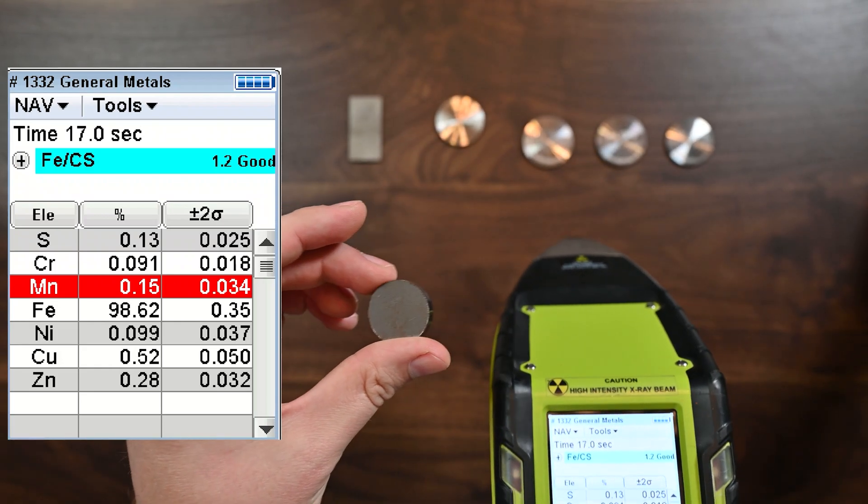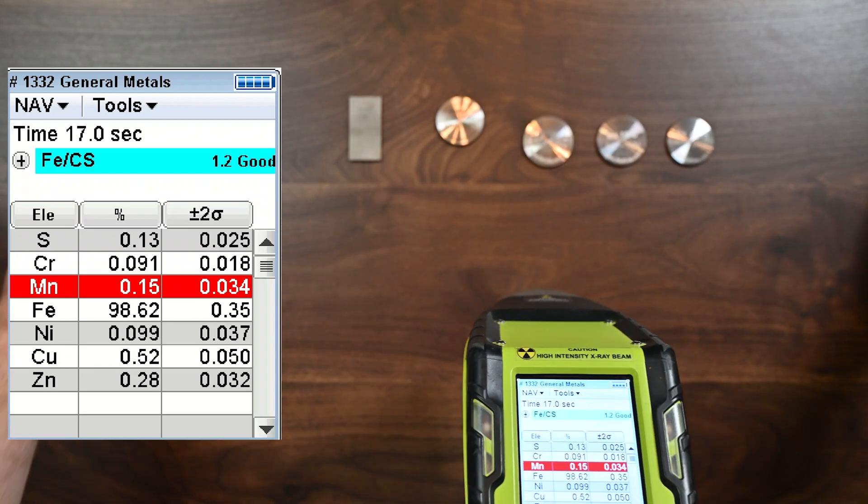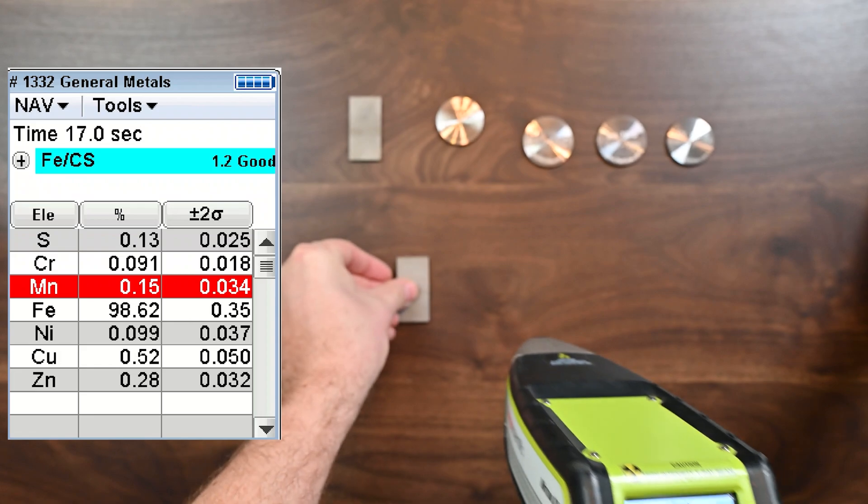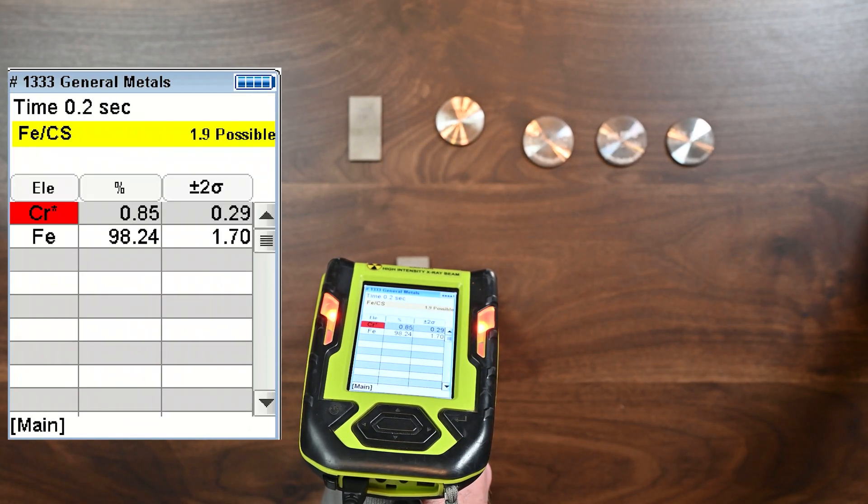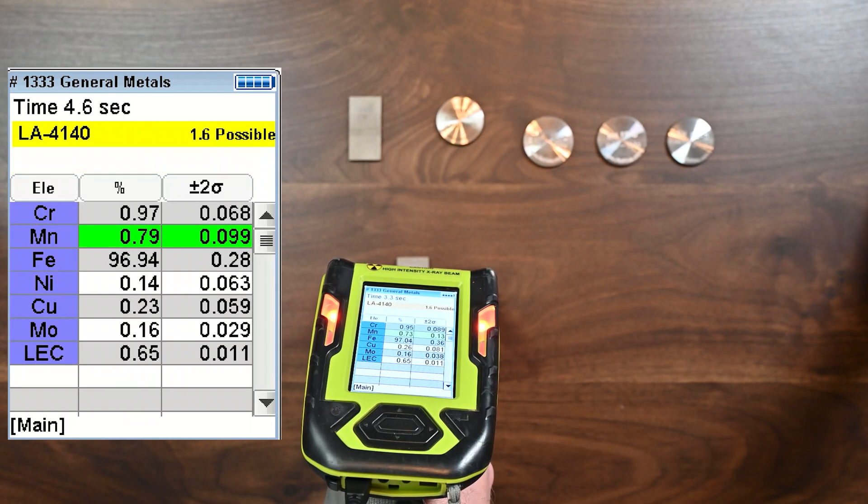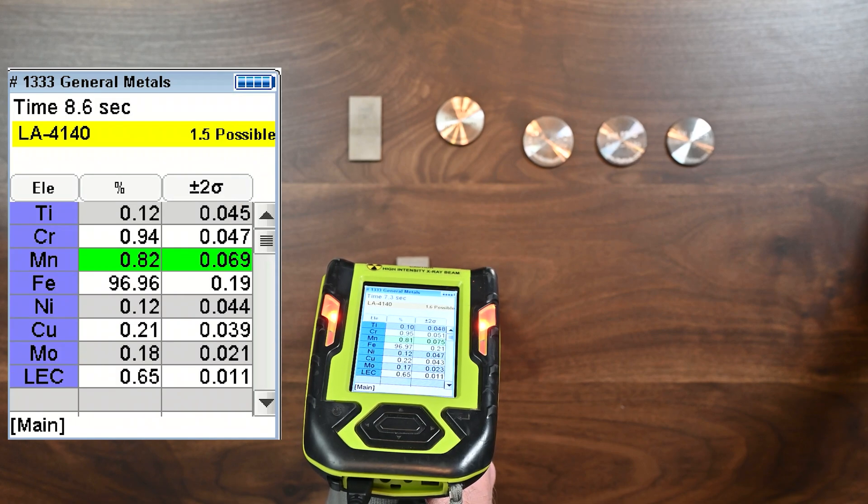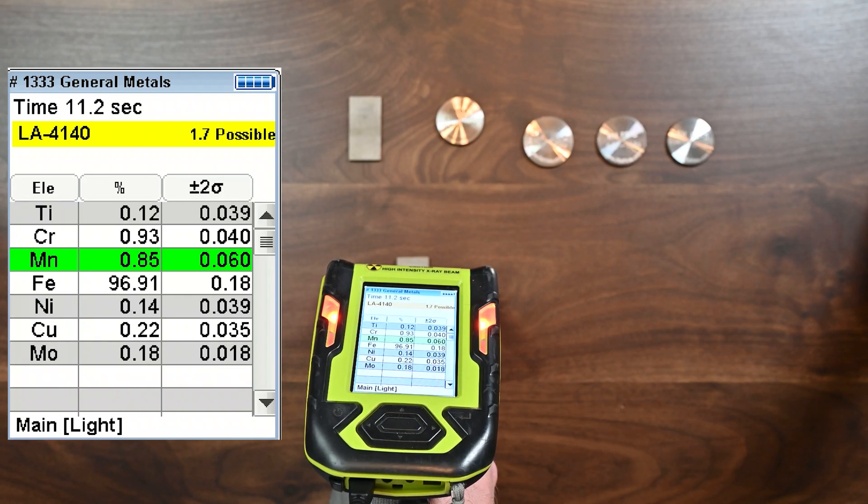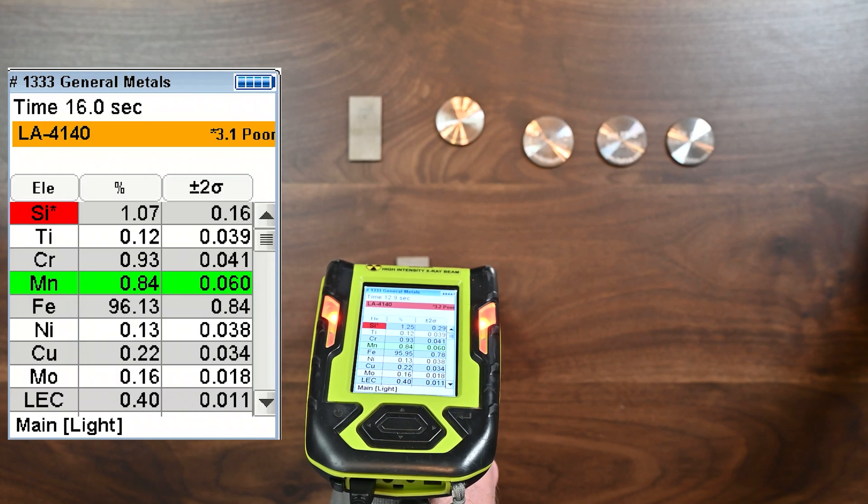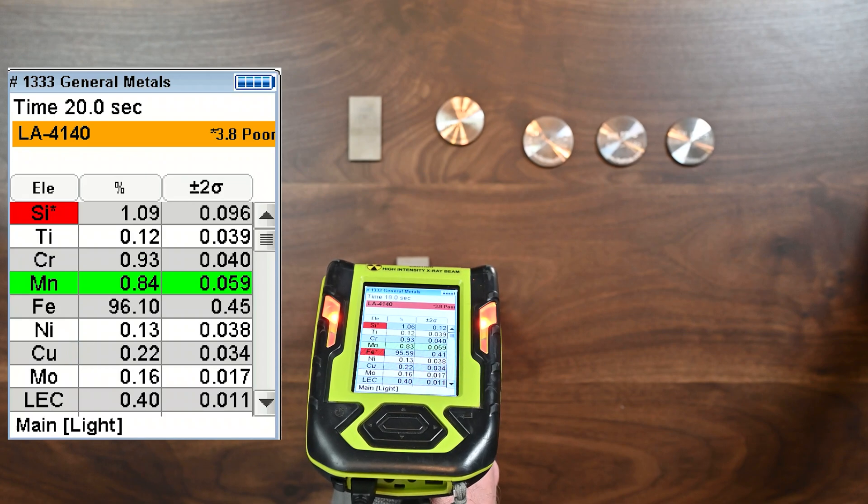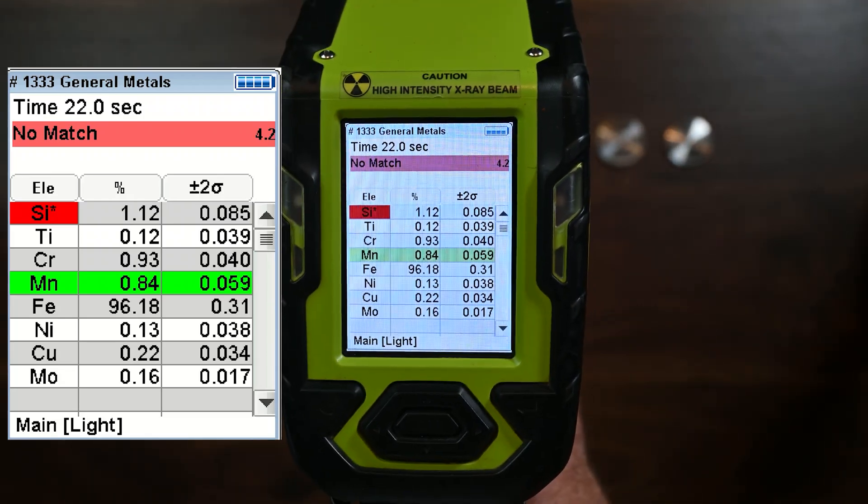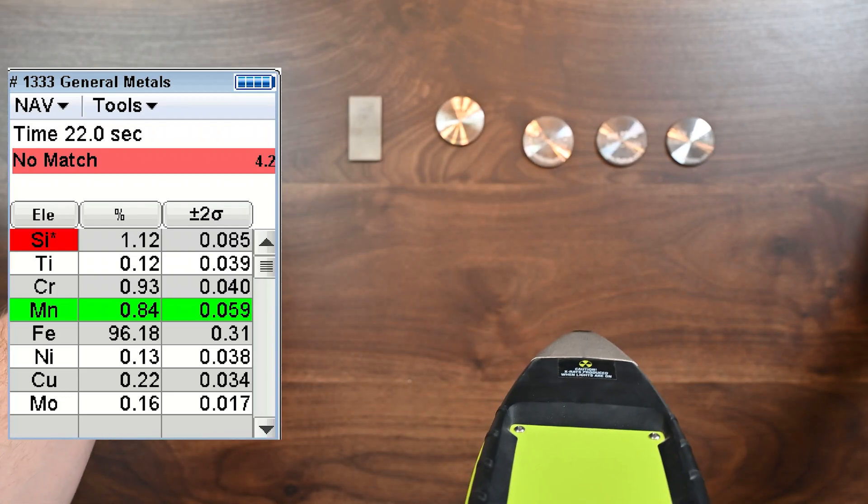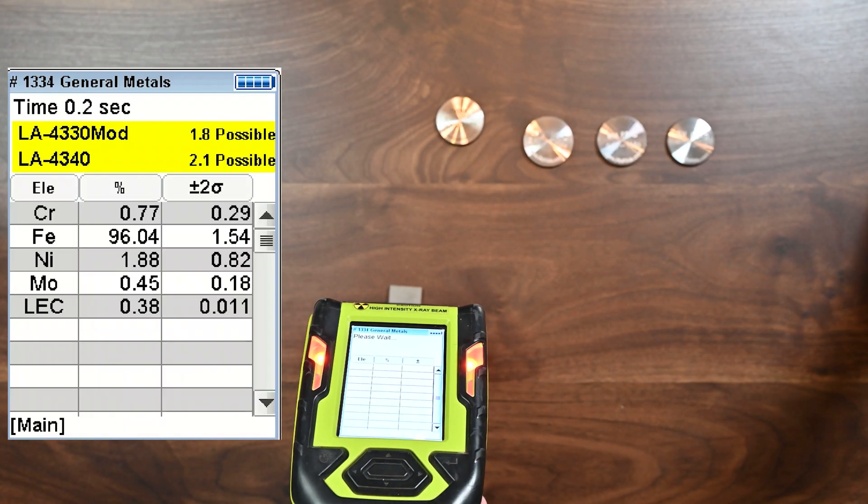You could definitely pick that up. And that's an important thing to look for in steel, especially if you're scrapping steel or melting steel, looking for those high copper parts. And it's not much, right? Less than half a percent is considered high in steel, many steels. So now we've got this 4140. How do we do with our chemical analysis there? So we'll just do a quick test and I'm going to let this one run a little longer too. And what you're going to find is that this Niton XL2 Plus is extremely fast when it's looking at these steels, and it's doing a great job of nailing the chemistry very early on. And at the same time, it's getting better over time, the more data we collect, which is great.